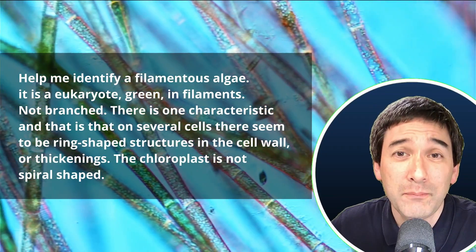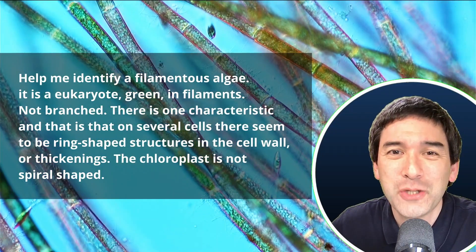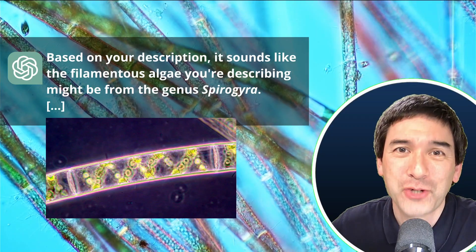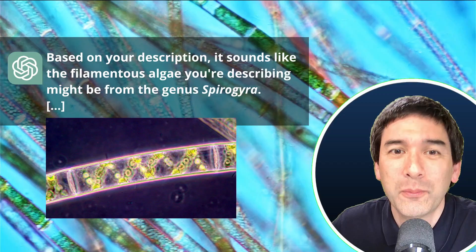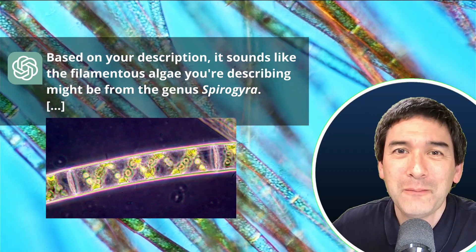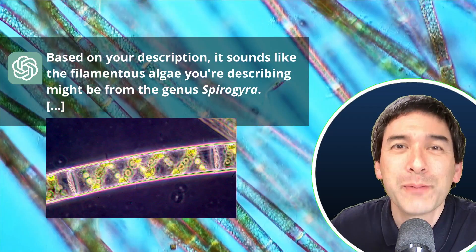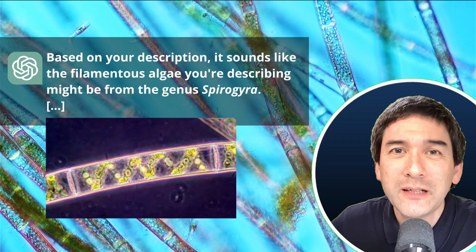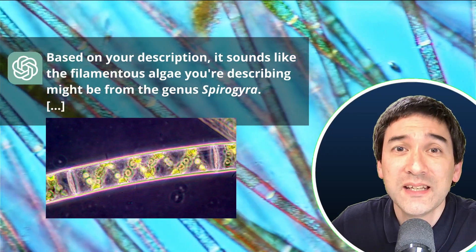And then I typed it in and indeed it did not take very long. And what did ChatGPT suggest? Well, exactly. It was actually spirogyra. So based on your description, it sounds like the filamentous algae you're describing might be a form of the genus spirogyra. No, it's not here. I did include a picture. And in the picture you can clearly see that it looks very different because spirogyra has a spiral-shaped chloroplast, which we do not have here. And it completely ignored those ring-like cells or those ring-like thickenings in some of the cells.